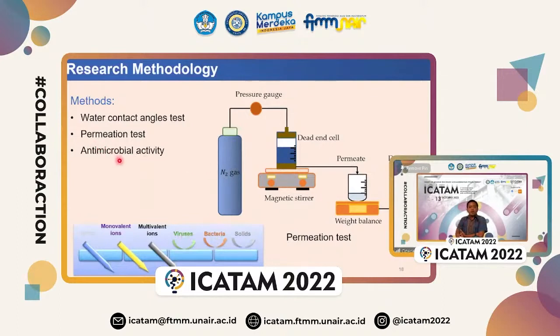And then for the antimicrobial activity, we use a microbiology test on the surface of the membrane. For the antimicrobial test, we use the same setup, but we need to change the pure water to contaminated water, like river water or irrigation water that has so many bacteria inside.